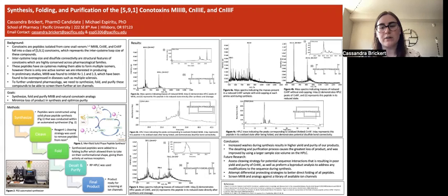This, however, can also cause lower yield of our product. We did this to hopefully better synthesize CnIIIF in figure 4A compared to figure 4B. With capping, we actually did not produce our intended masses, and it made our product less pure. It also cut our yield in half.